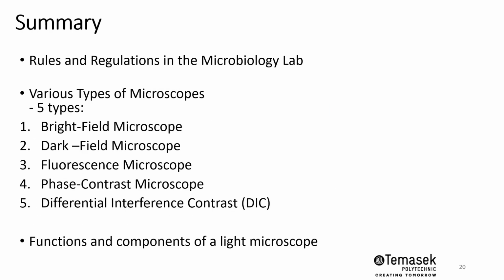So in summary, we have gone through the rules and regulations while working in the microbiology lab. Okay, this includes wearing your PPE, that includes a lab coat, covered shoes and long pants, as well as wearing eye goggles if you're working with any open tube experiments in the lab. Okay, adhering to safety regulations that include tying up your long hair, and restraining any loose clothing such as a tie. Okay, you don't want your tie to be stuck in any of the equipment that we use in the laboratory.